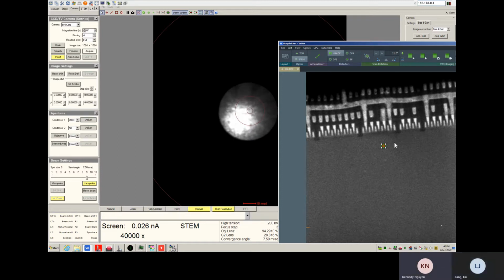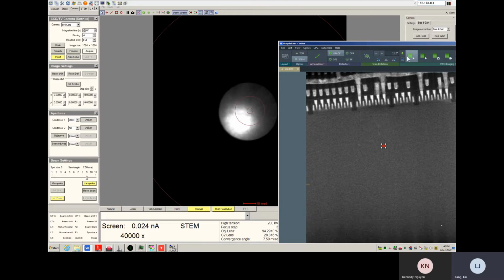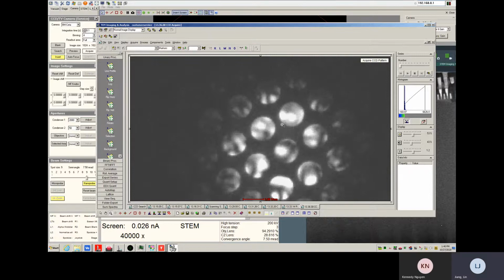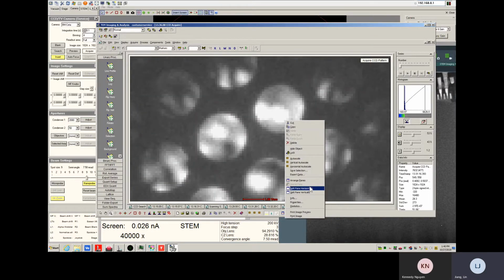Can you give me some examples of why they would do convergent beam versus normal diffraction? Yeah, usually people do convergent beam diffraction because they want to see information from within the disk. They want to see such information within your diffraction disk. It's not just about the orientation.